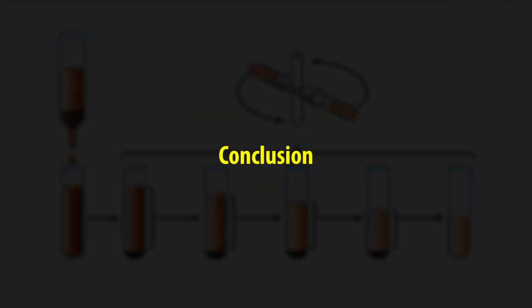In conclusion, subcellular fractionation is a cornerstone of modern biology, allowing the separation and detailed study of organelles, macromolecules, and genetic material.